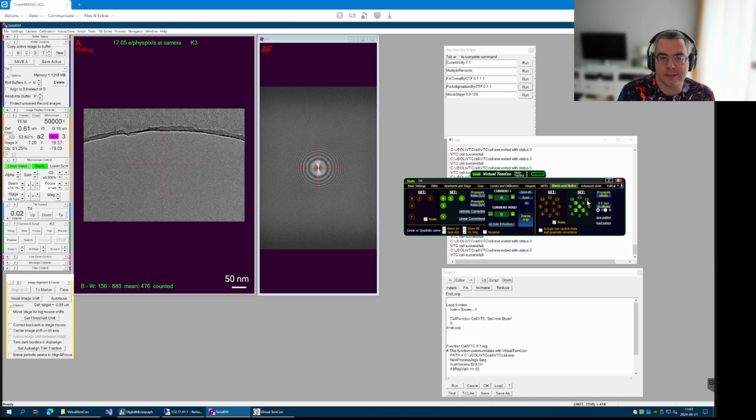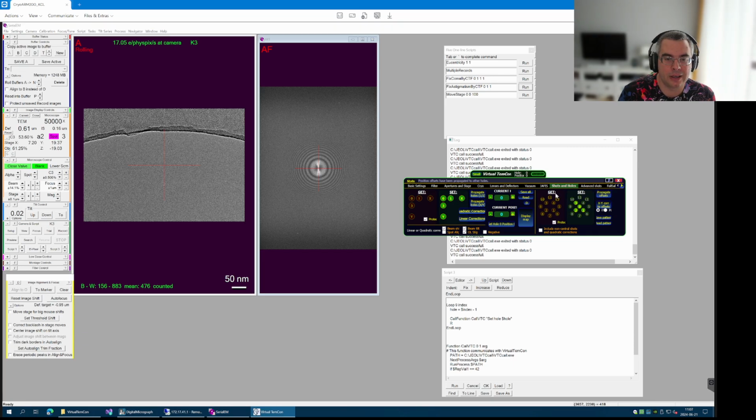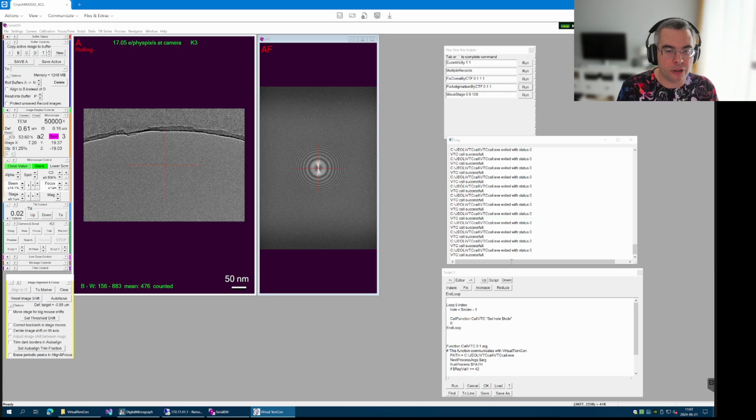After doing this, I have to click on propagate offsets, and then I have to click on propagate holes X, Y again. This will make sure that the same offsets will be applied for every other hole, and also that the corrections will be applied to the positional offsets. That's it. We don't need to do anything else.